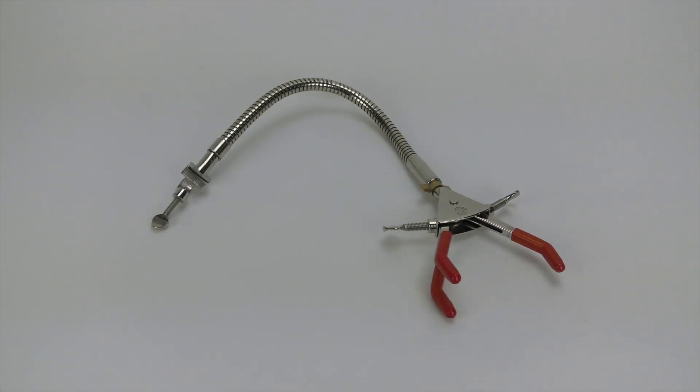In a laboratory, you may need to hold an apparatus at a unique position where other traditional clamps do not fit.